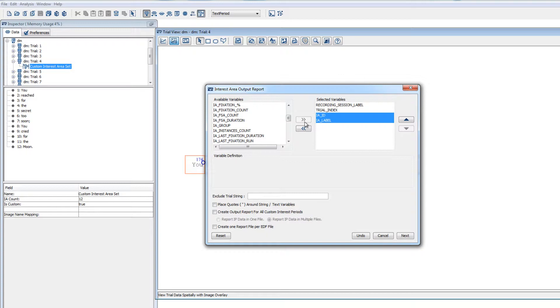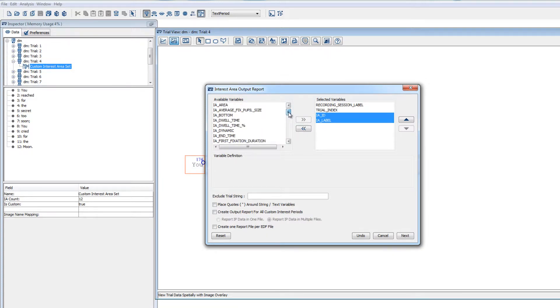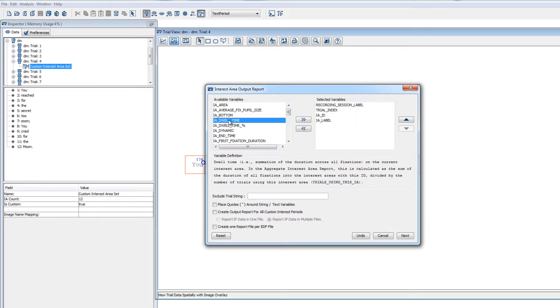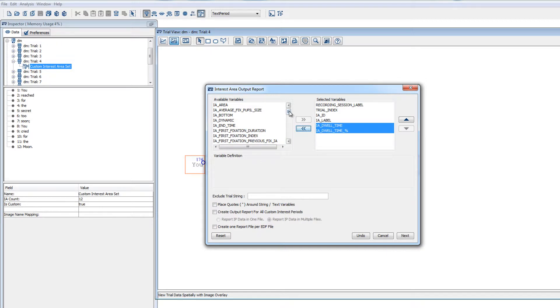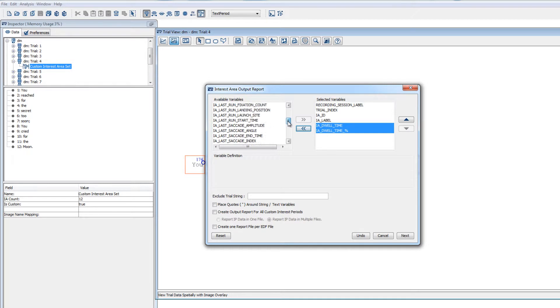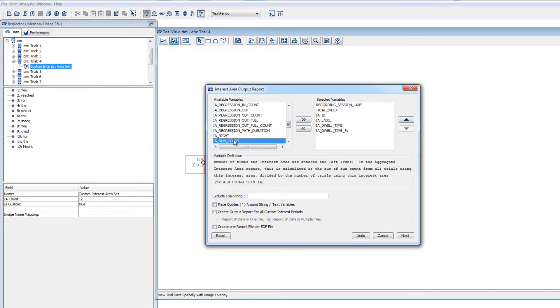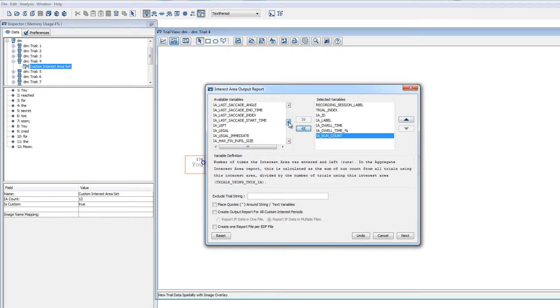For an interest area report, the simplest and most commonly used dependent measures are IA dwell time and IA dwell time percentage, which are the sum of the durations of all the fixations on the interest area, and the percentage of this dwell time on the interest area respectively. You can also include information about how many runs or sets of consecutive fixations on an interest area there were for each trial. And you can include the time when each interest area was first fixated.